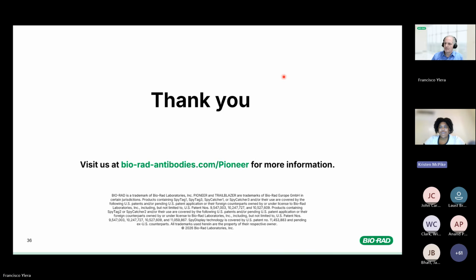Great. Thank you. And now from Abance, a concern regarding synthetic libraries is mostly off-target binding. Is this something you still observe, or do you believe this is something of the past for synthetic libraries? It is a topic for all antibodies, not just phage display antibodies, and should be analyzed.